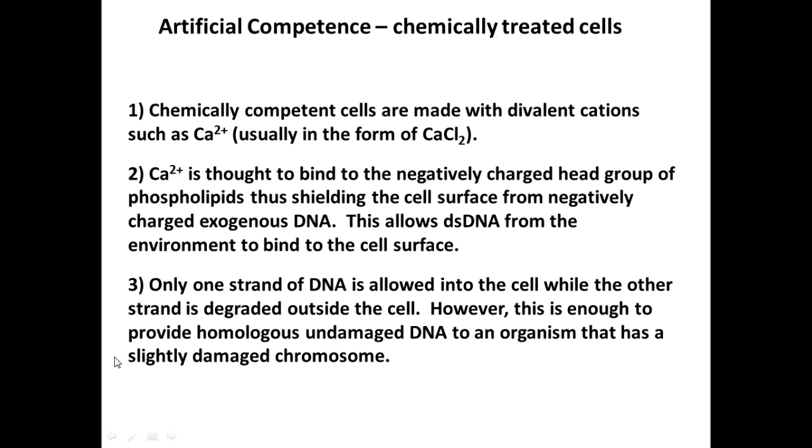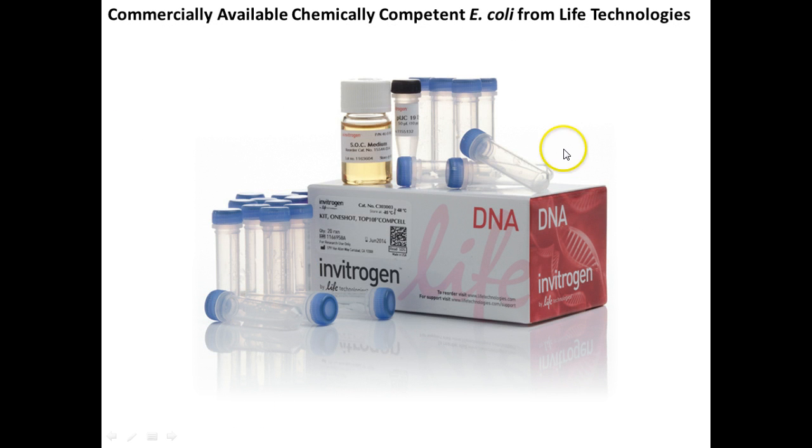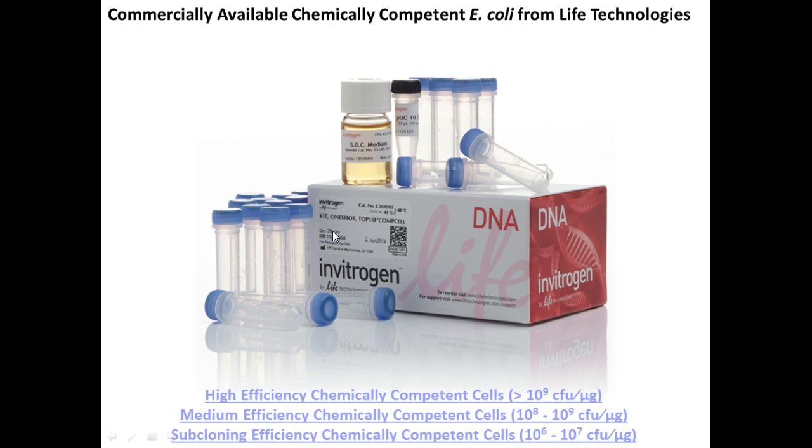So the belief is that those positively charged calcium ions interact with the negatively charged ions associated with the membranes and help the DNA pass through. Only one strand of the DNA goes in. Okay, same thing for regular transformation. And then inside it'll copy the information and make it double-stranded. In this case today, as I said, we're using a specialized set of chemically competent cells.